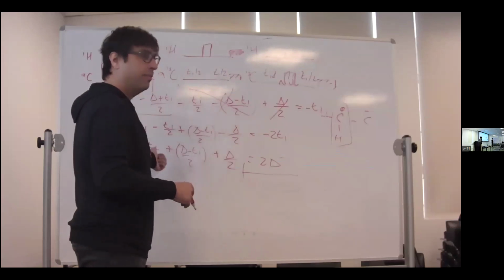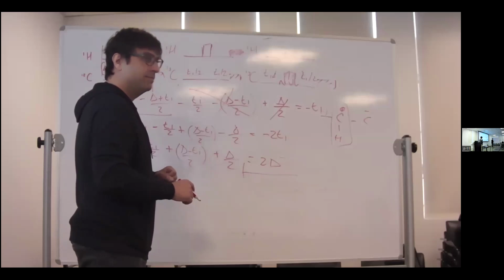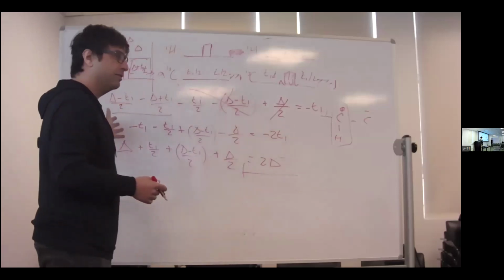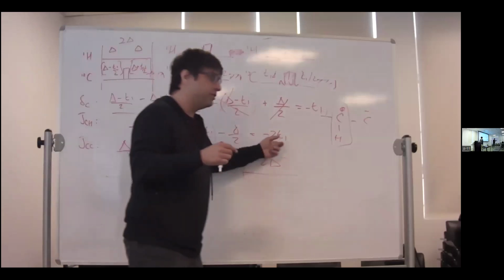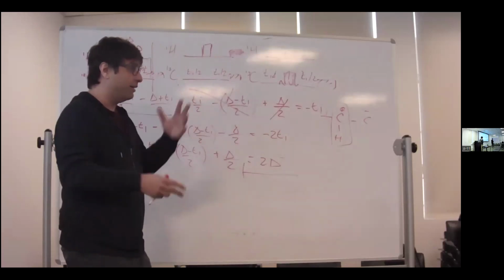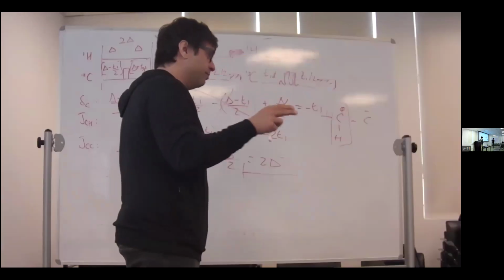So is carbon-carbon coupling evolving? What am I gonna see in this experiment? Do we see carbon chemical shifts? Yes, wonderful, carbon chemical shifts. When I see carbon-proton splittings, they're gonna be double, because there's two people. So this is a coupling enhanced scheme. Will I evolve carbon-carbon? No. So if I constructed a constant time coupling enhanced sequence, where I double the apparent splittings, but retain the constant time.